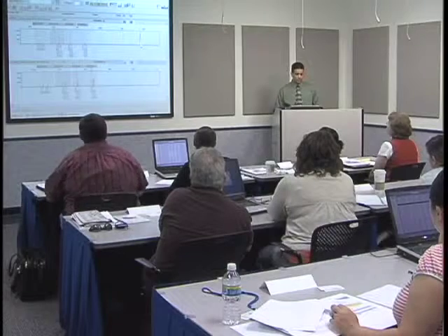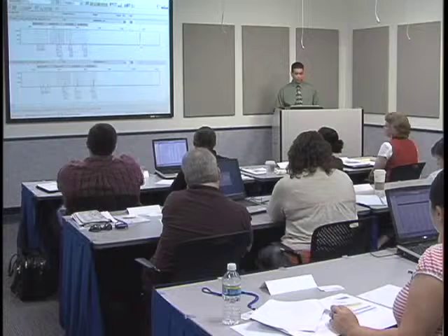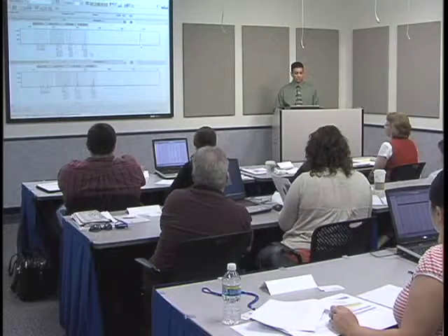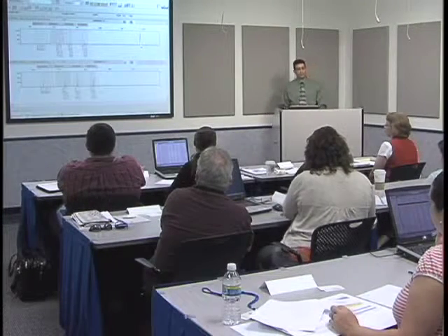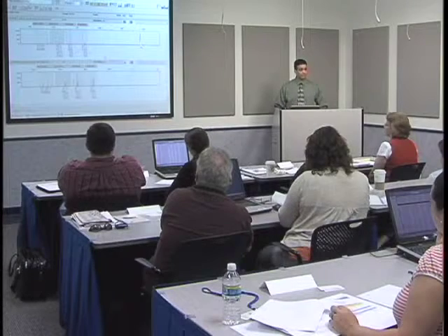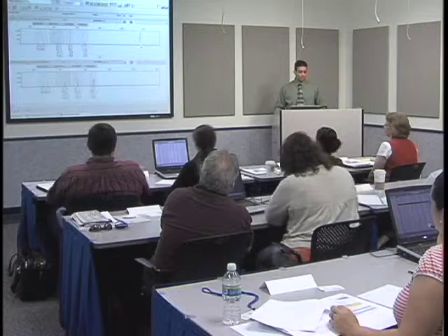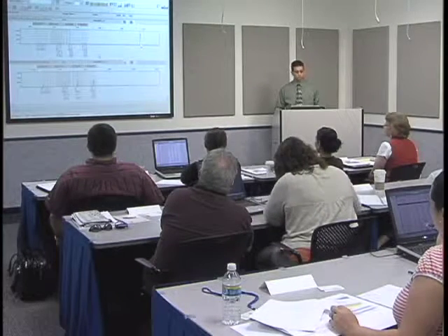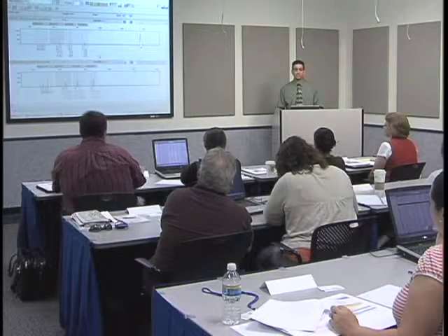So if you look at something like this, for those of you who are at 150, this top profile is totally not usable. But this to me is the case where MinElute is easy to implement now, because this is something where I can see the entire profile. I can actually have it called by GeneMapper. I know that my suspect is an 11, 15 at 32.2, 33.2, but my protocols say I need it to be over 150 RFUs before I can make an allele call.